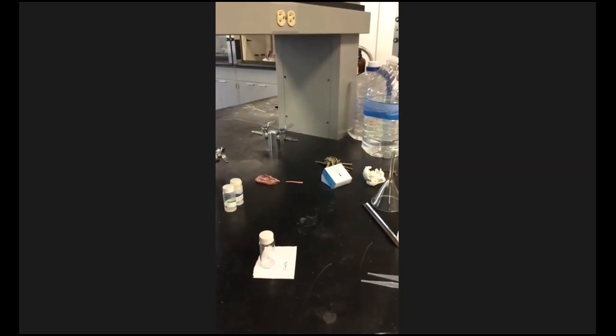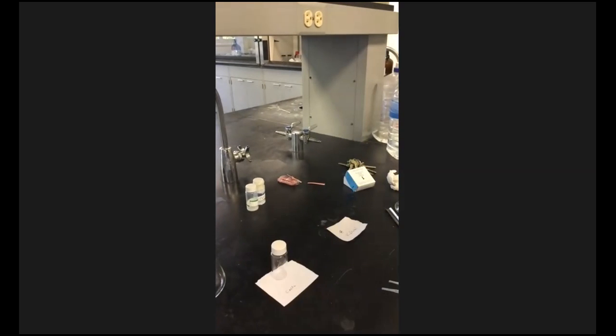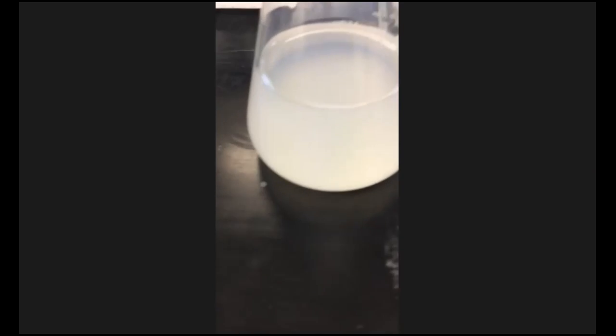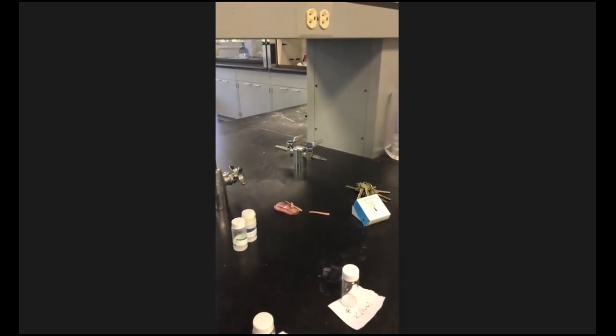All right. So we're going to take out, and you can see here I have that label, calcium chloride, and I have the other one labeled potassium oxalate. I keep wanting to say chromate. You can see now this is starting to settle, so it's a little bit clearer. If we add some potassium oxalate to that, or we add some calcium chloride to it, we're going to be able to tell which one is limiting.